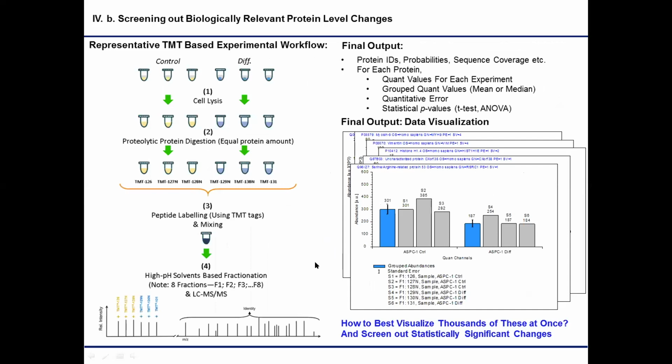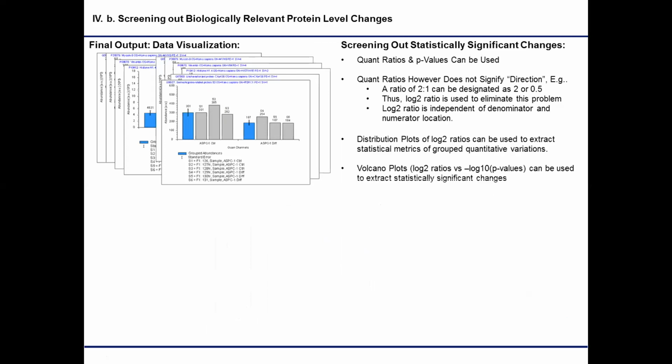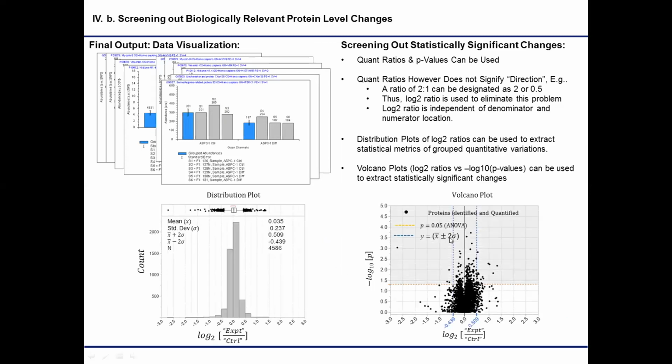So what's the 2 sigma, the confidence interval is 95% confidence, is that correct? The confidence interval value is actually very strict here. I didn't calculate exactly. It is mean plus or minus, maybe around 0.98 or something like that. Oh, it's higher than that. It's much higher, yeah. If you take the confidence intervals, it will be somewhere here in this value. So this is the most strict way of doing it, I would say.